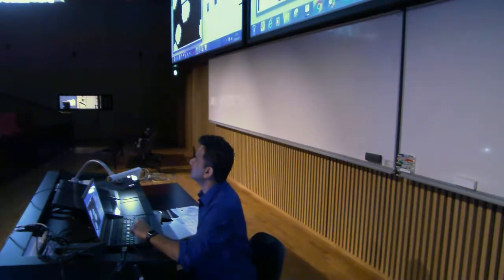Yes. If you have several images that you want to compare, and you go to threshold, then it will set an automatic threshold for each individual image. Would you say this is the most appropriate way to do it, or would you set a manual threshold that is the same for every image that you want to compare? I get that question a lot, especially for high content screening, because once you set one threshold, that should be applicable for both groups, right? The control and the experiment.